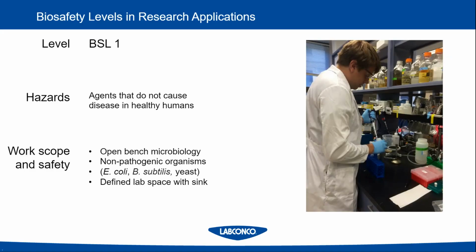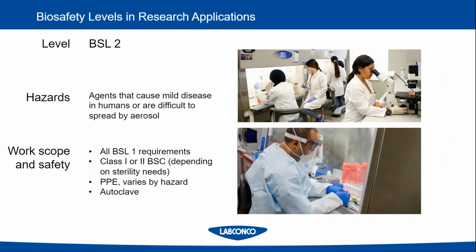These microbes can be used on open bench microbiology, so what you would think of as a typical laboratory bench setting. Really the only guidelines are that experiments with these microbes should take place in a dedicated laboratory space with its own sink, and there really aren't a lot of serious precautions for containment or isolation of these microbes.